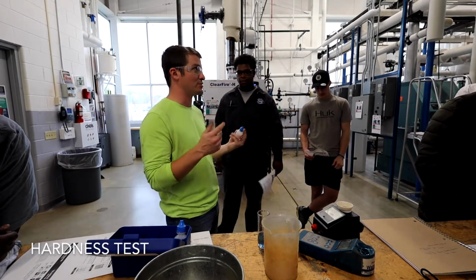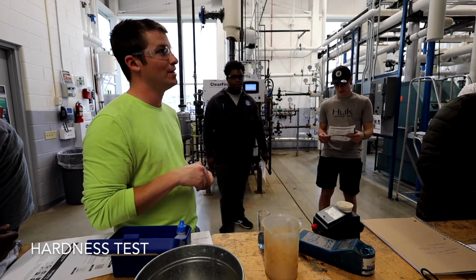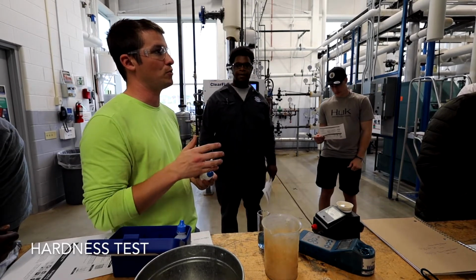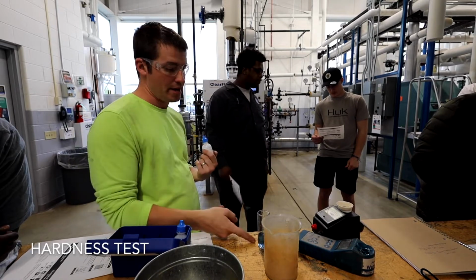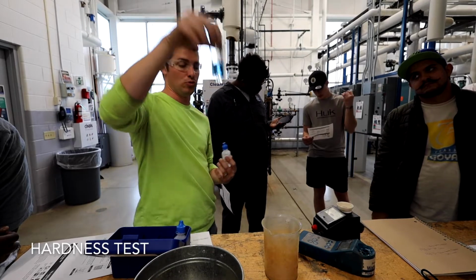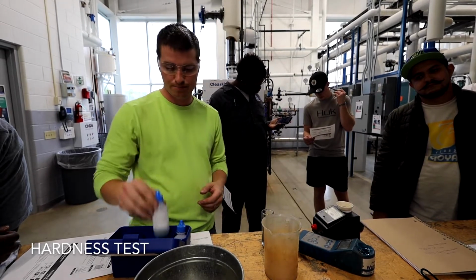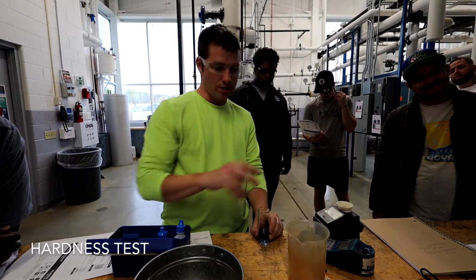So just keep that in mind as a little tip, if you're testing in your facility and you're like, oh, man, I really can't tell. It never seems to go blue, it just stays purple. Something's interfering, right? So if you do that little hack, it might make it easier for you to get an actual true color change where like we know that's blue, right? Unless you're colorblind. So, all right, so we did conductivity, 60, good.